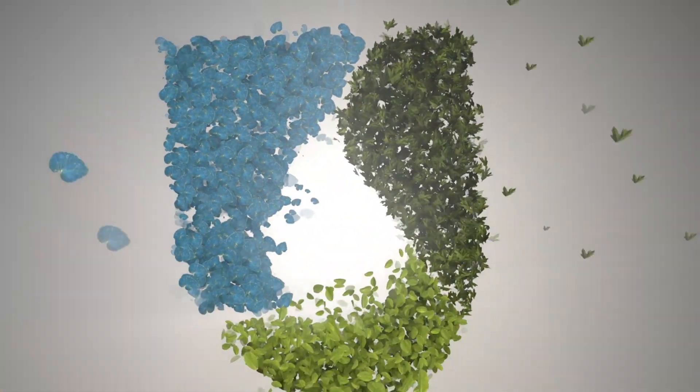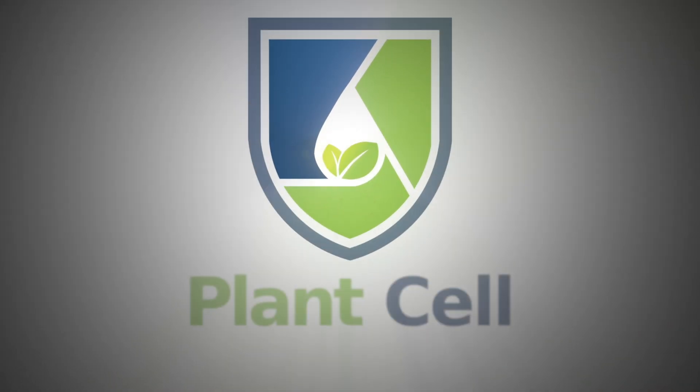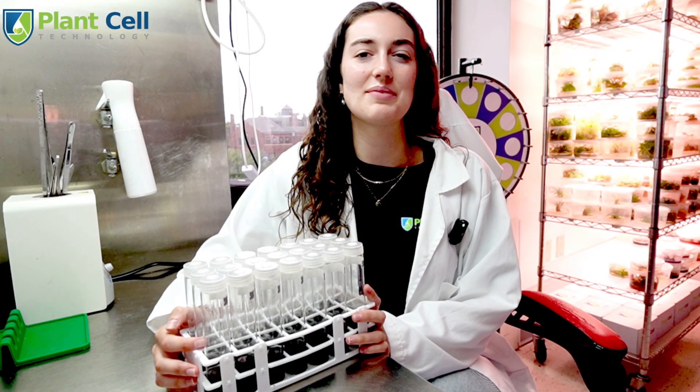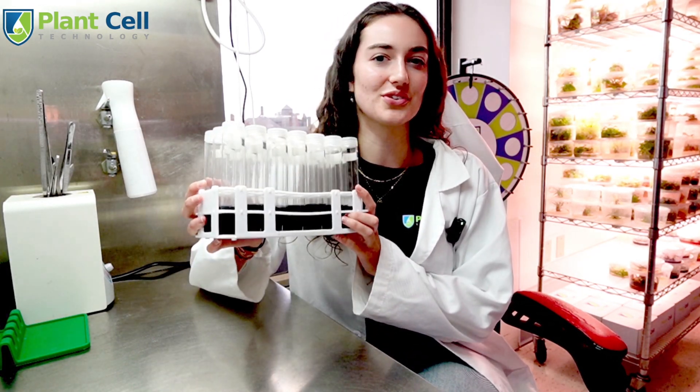Today I will show you how to flask orchid seeds. Hi, my name is Anna and I am with Plant Cell Technology. I'll be showing you how to grow orchids from seeds in tissue culture.